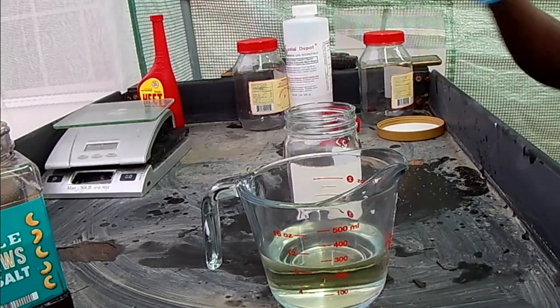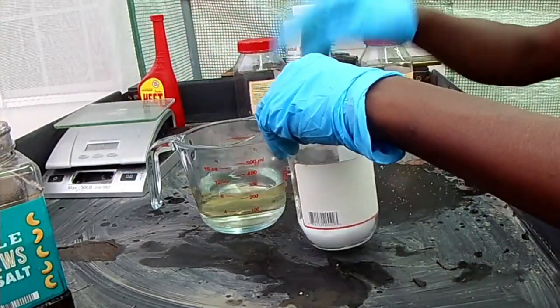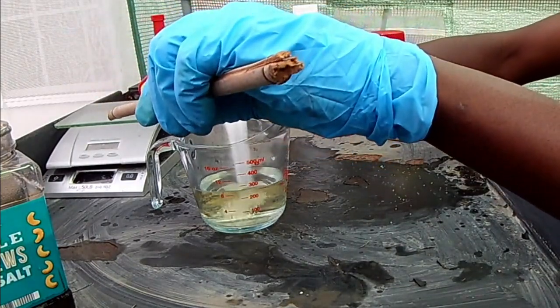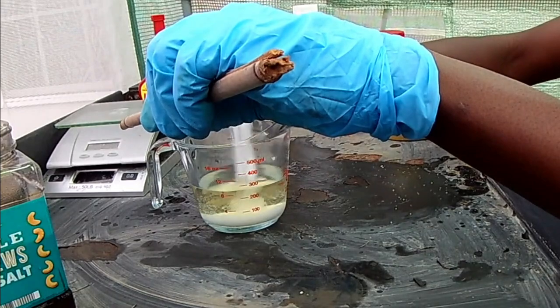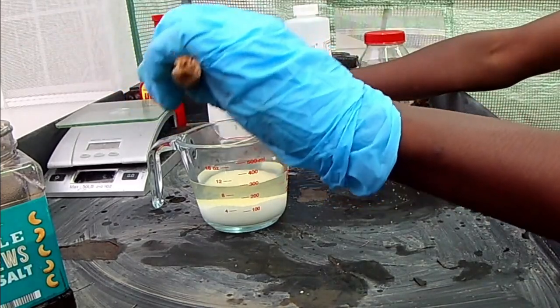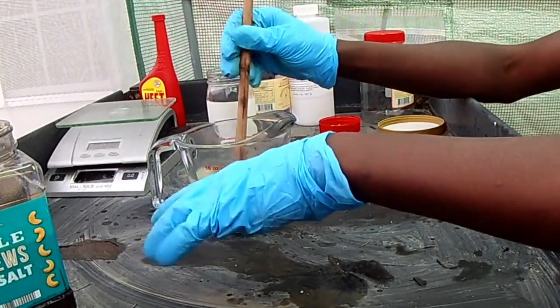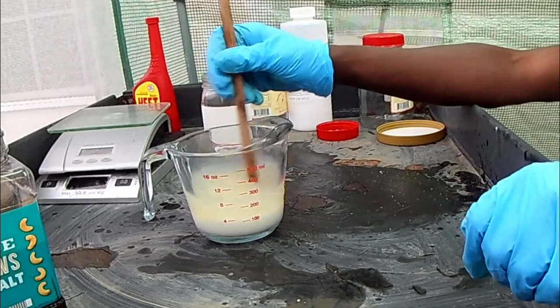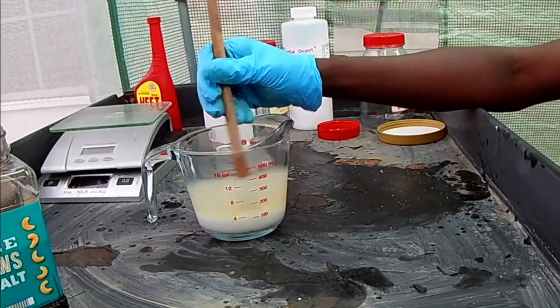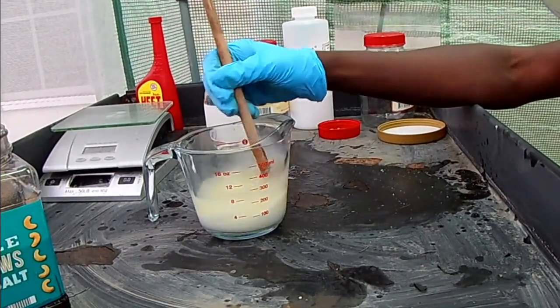Now we're going to pour this sodium hydroxide into the ethanol solution. This is the more dangerous part — you don't want this stuff splashing on you. It's going to be an exothermic reaction, meaning it will make heat, which is why I'm doing this in glass. I wouldn't do this in plastic anyway. We're just going to stir it and mix it all together. We want to get all the clumps out, because I heard that if you leave clumps in, you'll just end up making soap in the end. It's dissolving slowly, but it's taking its time.